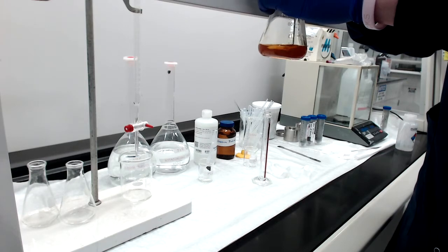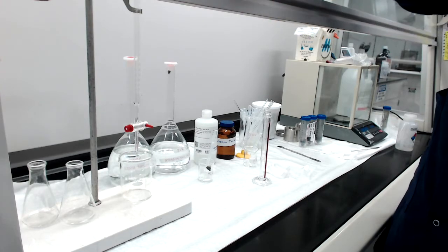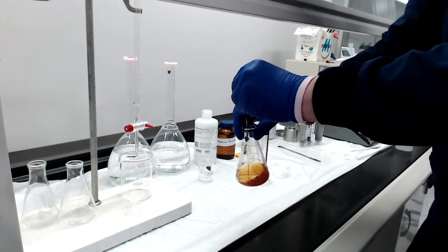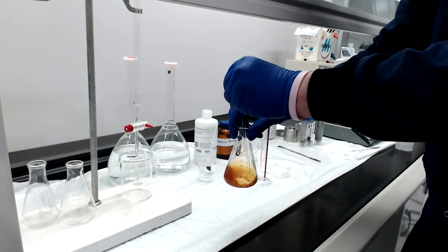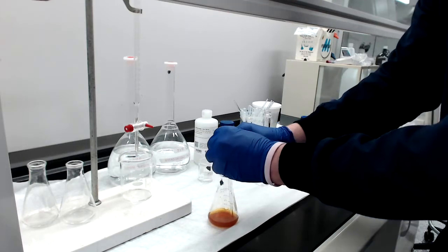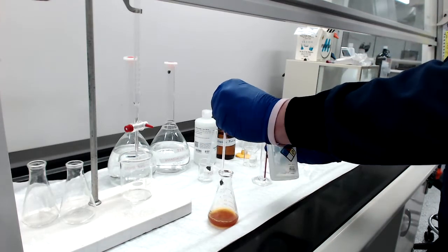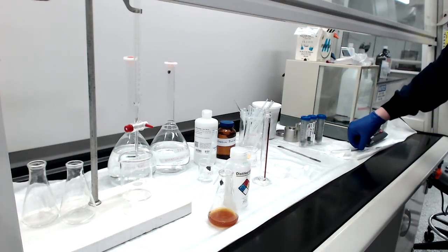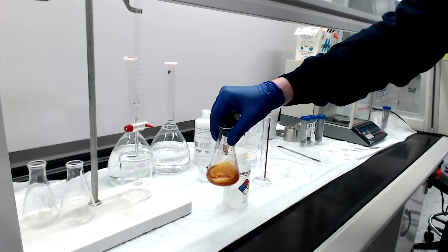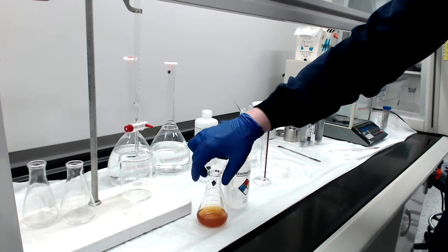I'm going to try to get as much of that dissolved as I can, twirling it around. Anytime you use a glass stir rod, at the end use water to make sure you rinse off all that solution so it stays in the beaker and not on the glass rod. You can see this orange-yellow color — this is typical of I₂.